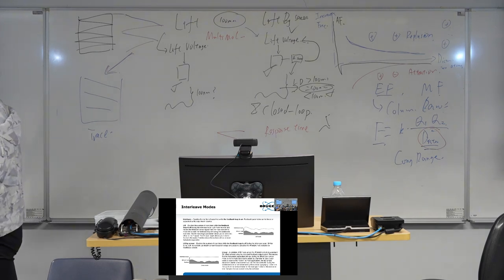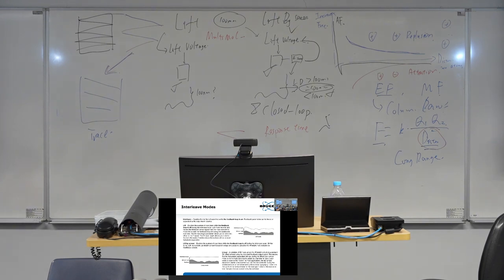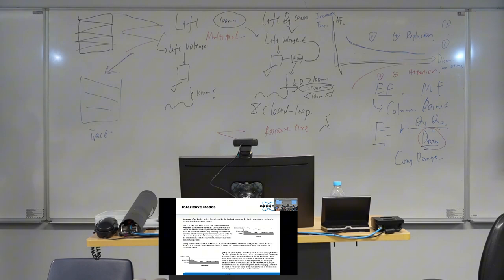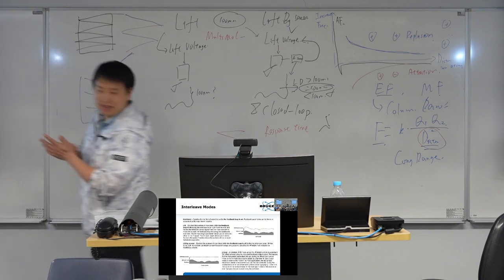In principle, this mode can tell us the difference at each point, but physically we don't like it because the distance between the tip and the sample is always changing. So we provide this option, but in science it's not that useful. So choose lift or lift by sensor.